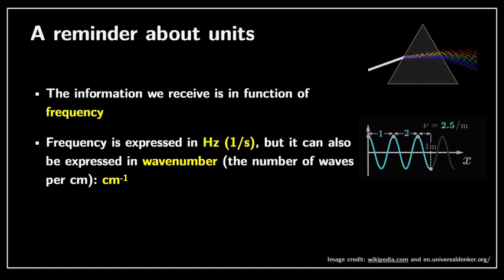Okay, so that's nice. This is important to know. You might see some data given in terahertz, so 10 to the power 12 hertz. This is not unusual because terahertz actually corresponds to the same range as wave number, more or less. I think there's a factor of 33 between the two. But chemists, physicists and material scientists usually use wave numbers, but it's not unusual to see terahertz.